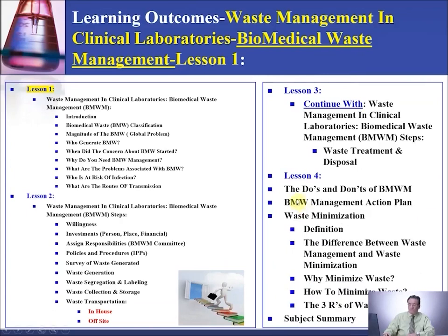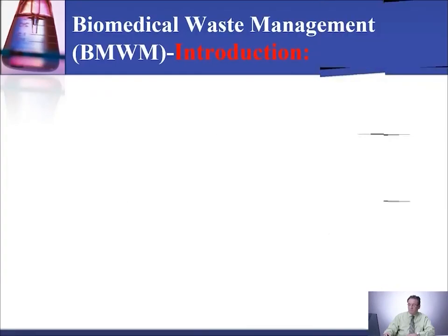In Lesson 4, we'll talk about the do's and don'ts of biomedical waste management. Then we'll discuss the biomedical waste management action plan. And then we'll talk about waste minimization. Under that, we'll give you a definition and the difference between waste management and waste minimization, why we should minimize waste, how to minimize waste, and the 3 R's of waste reduction, then a subject summary. So let's start with Lesson 1.